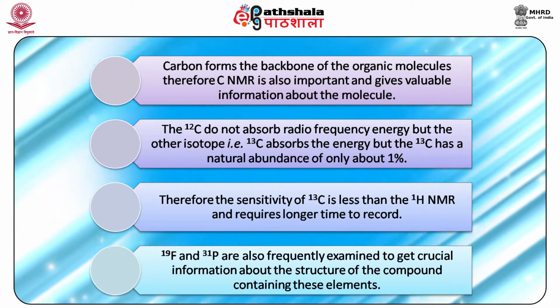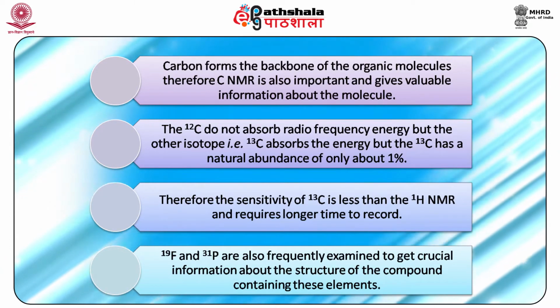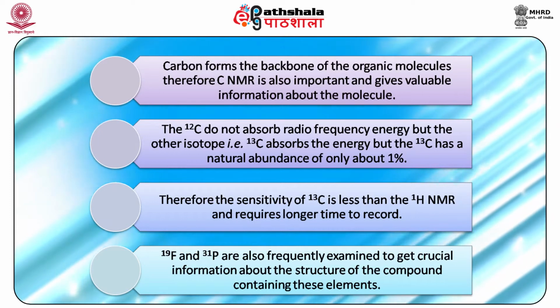Therefore, the sensitivity of 13C is less than that of proton NMR, that is the 1H NMR, and it requires a longer time to record the 13C NMR.